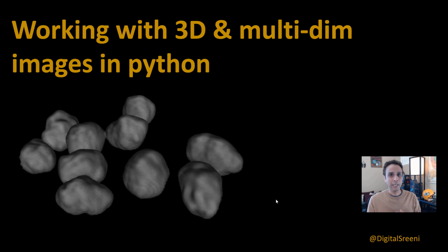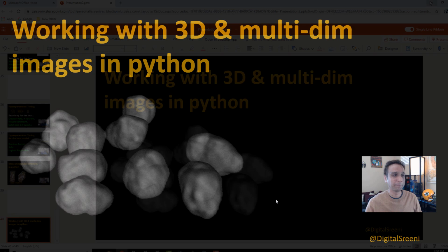Not every library that's available out there is applicable to 3D space. In fact, very few of these modules are written for 3D space. It's unfortunate, but we can always work with 3D images and apply these one 2D slice at a time. Okay, now let's jump into the code and get it done. Okay, so let's jump in.